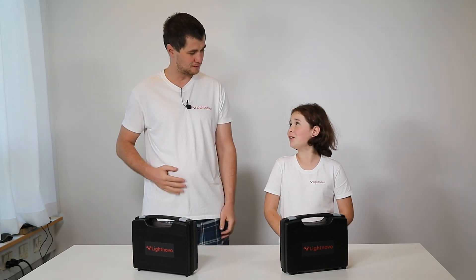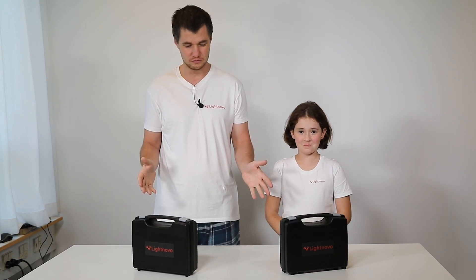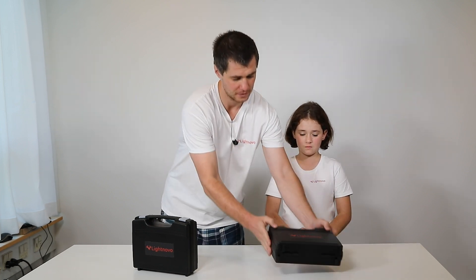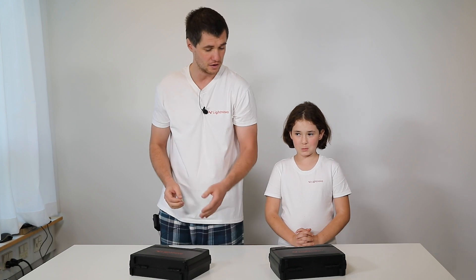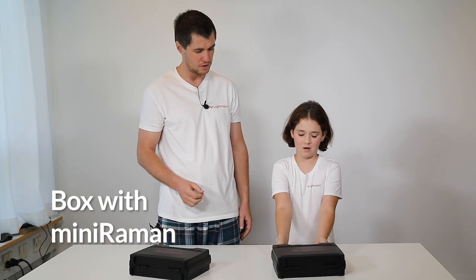Hello Sofia. Hello Alexey. Today with Sofia we will introduce you to our Miniraman spectrometers. We will unpack them and show all accessories they contain and how to attach them to Miniraman. Sofia, could you please help me to open the first box with the Miniraman?